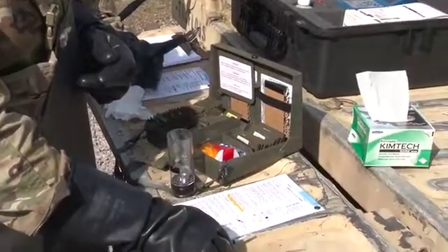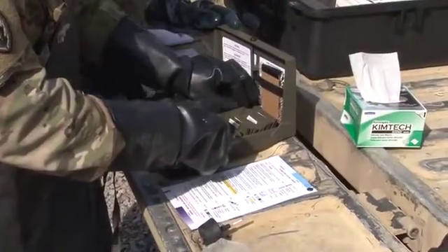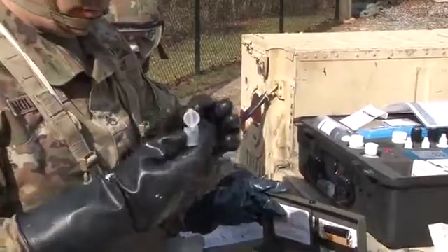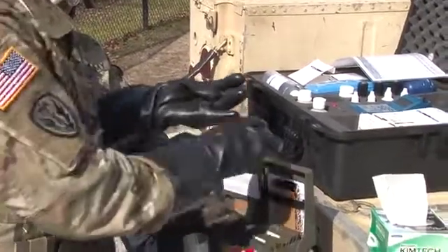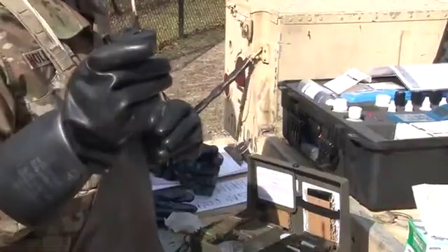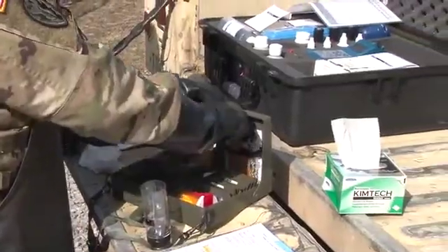In the bottom right corner of your kit, you will find a small container of connector vials. Remove the small container of connectors from your kit. Flip open the container and remove one connector. Close the container and return it to the kit. Attach the connector to the top of your blue band tube, which is attached to the stopper, and set it aside.